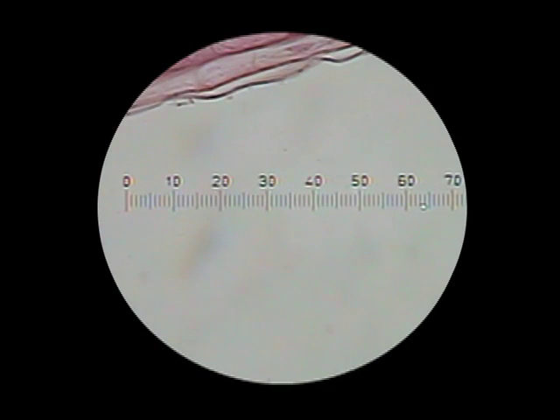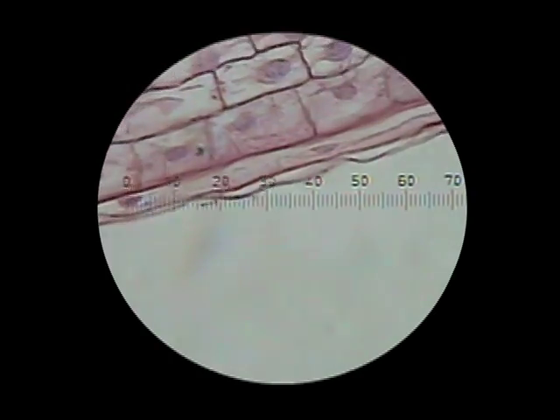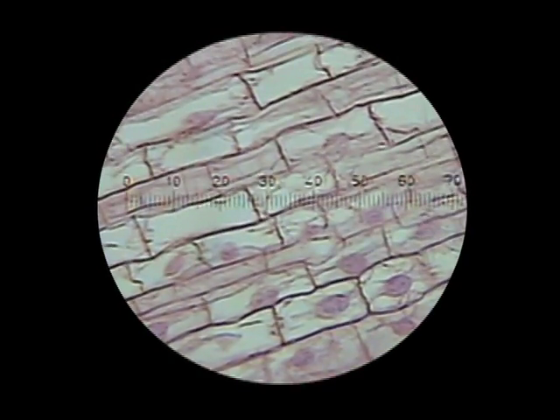Ocular lenses may also have a measuring device, often called the ocular micrometer. This will be discussed later in this video.